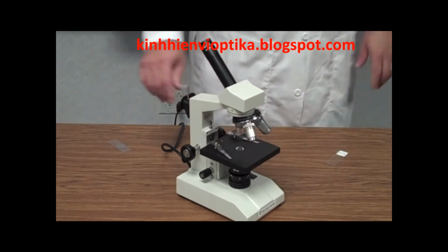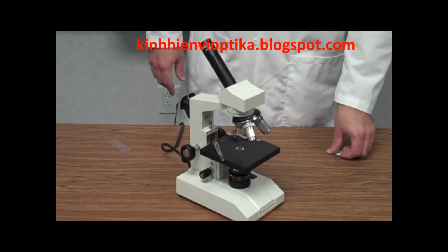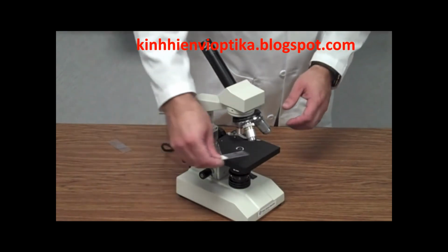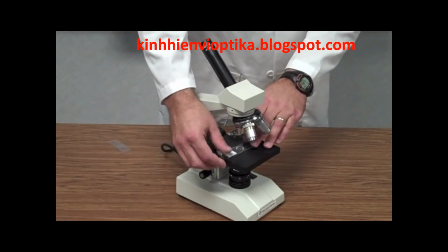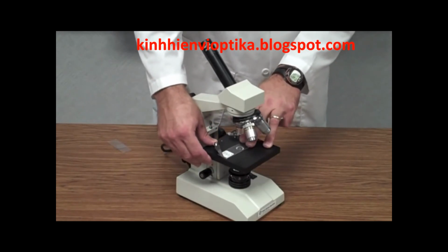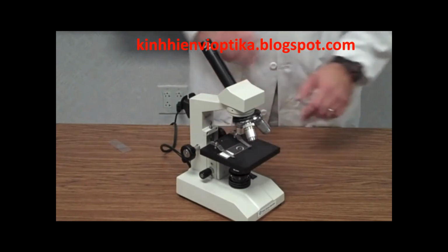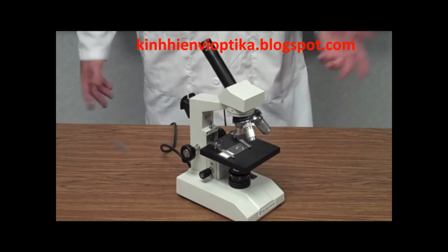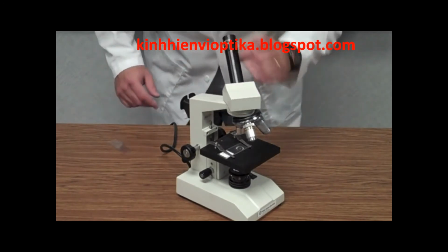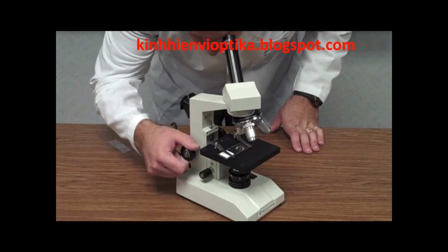Okay, so stage is all the way down. We're on 3 on the diaphragm. Our light is on. Then we take our prepared slide and we're going to put it on the stage, and we're going to get that specimen, that piece of frog skin, right over the top of that hole, and then we'll use our stage clips to lock it in place. Okay, now all we need to do is simply look through the eyepiece, okay? And as I'm looking through the eyepiece, I'm going to use the coarse adjustment knob, okay?